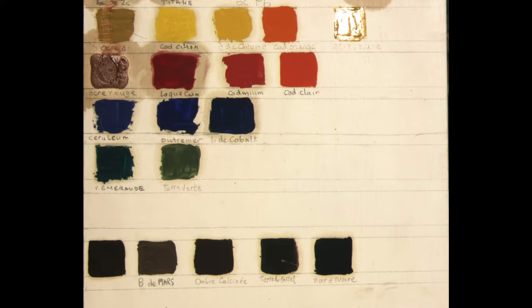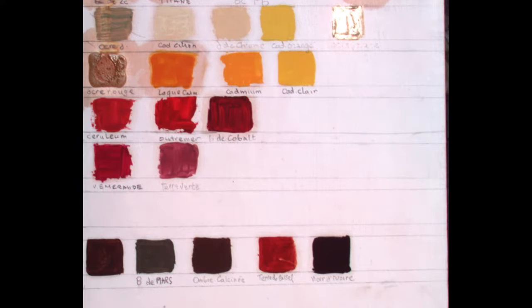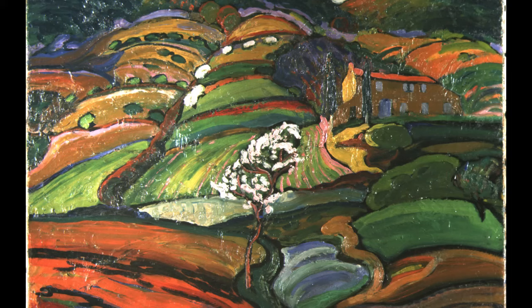False colour infrared photography. A whole range of pigments can be identified with this technique. False colour infrared photography makes it possible to identify pigments optically. Each colour has a corresponding pigment type, but also enables us to differentiate between paint layers applied using different techniques or in different eras. It is sometimes necessary to photograph several palettes with colour samples in specific wavelengths with the same lighting and the same computer and camera settings in order to compare the results with the photographs of the paintings. These colour palettes will be used to compare and identify optically some of the components of the various pigments used by the painter. The technique of false colour photography is one of the fastest and most effective means of reaching a conclusion about the quality and authenticity of a work.